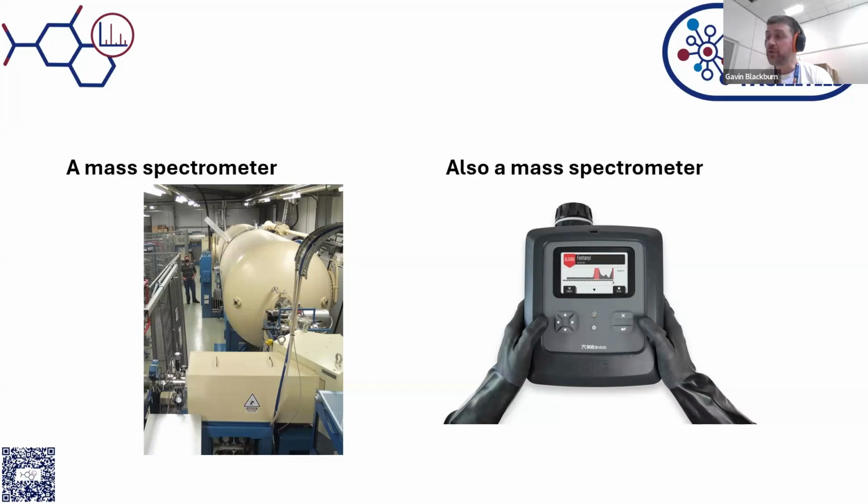And when they dug up the remains of a king in a Leicester car park, this is where those bones were sent, so that they could use these techniques to get an accurate date for when this person would have died. And then the instrument over on the right is also a mass spectrometer. This is a handheld mass spectrometer that can be used for chemical contamination detection. These things can get deployed for looking for things like chemical weapons. They've been developed so that if you are going and you're looking around collapsed buildings, can you find biomarkers of people who are alive so you know exactly where you should be looking in these buildings to find the people who really need your help.